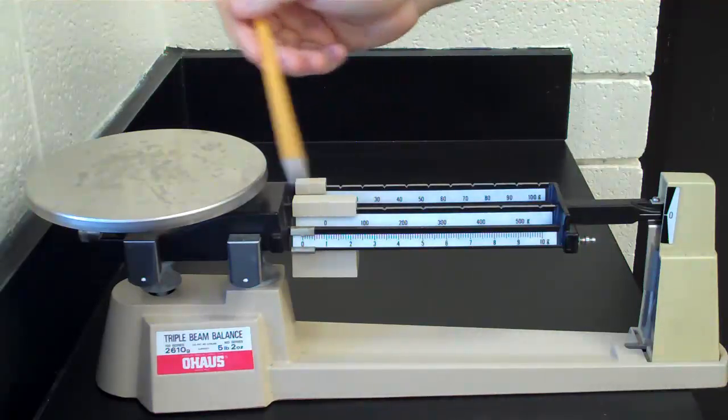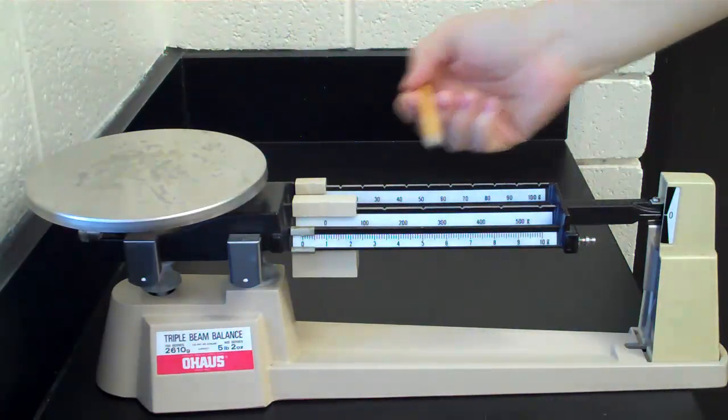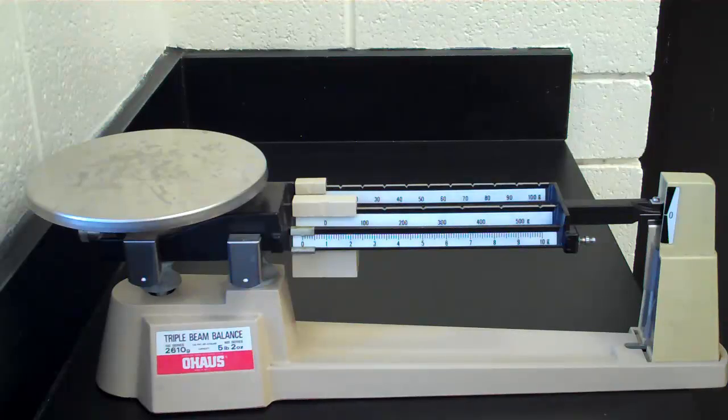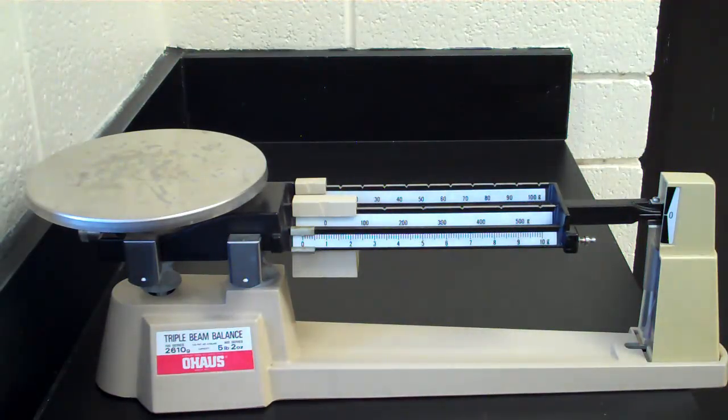Before checking the white line, we want to make sure that all of our weights are slid over all the way to the left. So now we've got that set up, we can use that and get an accurate recording.